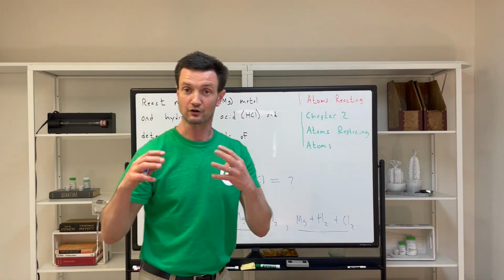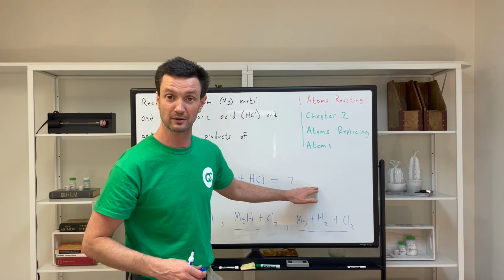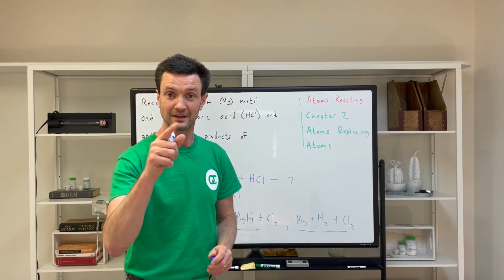And so this is our goal, is to simply react magnesium and hydrochloric acid and see what comes out on the other end. And there'll be a nice little test we can do which will help us, and I'll get to that in the lab video.